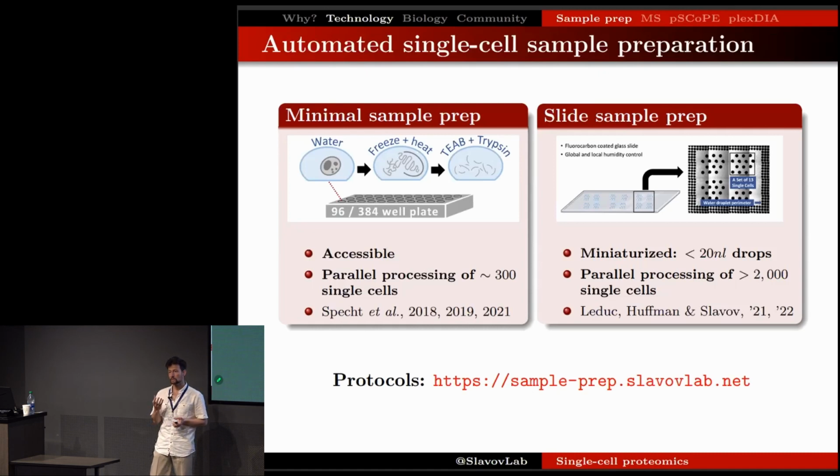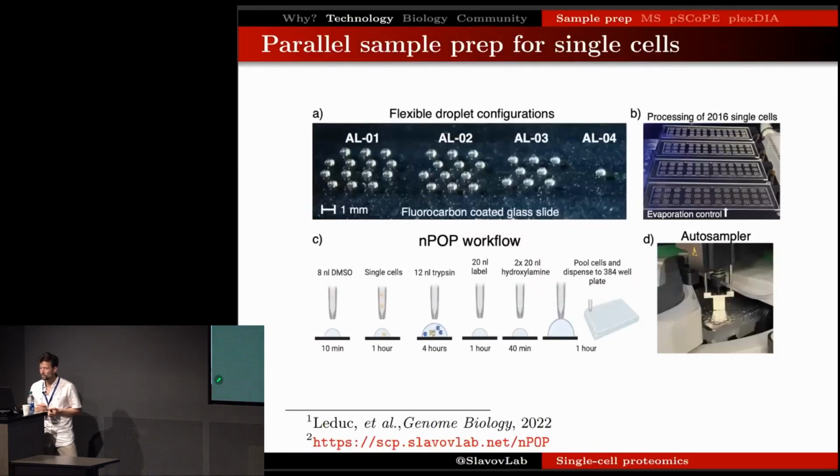And with the ambition of overcoming those challenges and increasing the throughput, increasing the robustness, Andrew Leduc worked on a slide sample preparation method that in many ways is realizing my dream to begin with of how sample preparation should work.